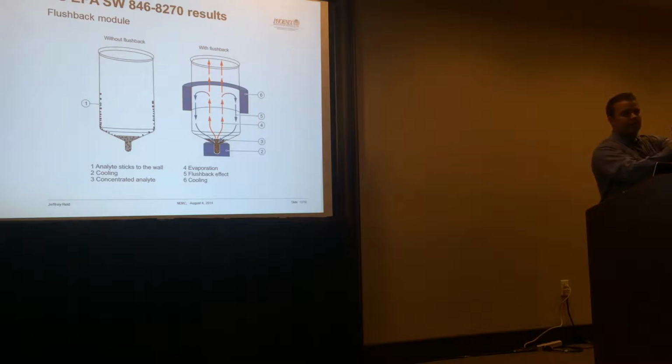Analyte can adhere to the glass vessels. So when you're doing a continuous rinse down, you're going to rinse the analyte that could stick to the glass vessels back into the appendage. So that's how you're able to achieve that higher one. Plus, let's say a volatile compound like naphthalene, which is pretty volatile, it's harder to bypass a chill zone that's set at 10 degrees Celsius. So it does that continuous rinse.